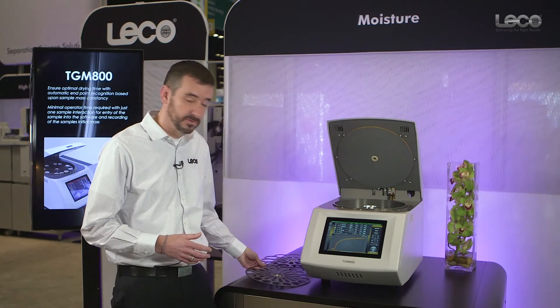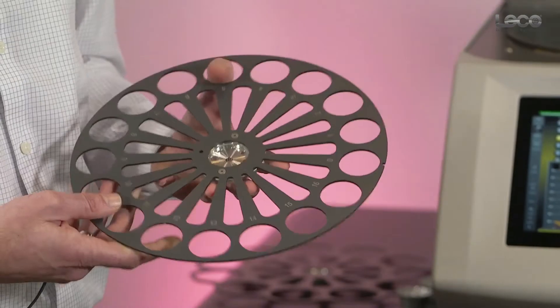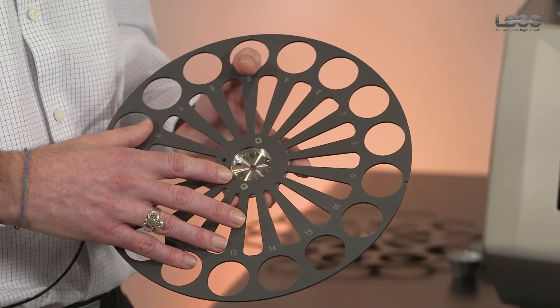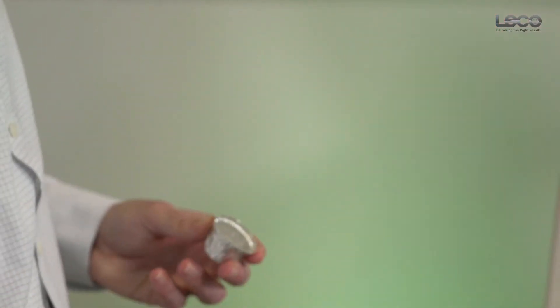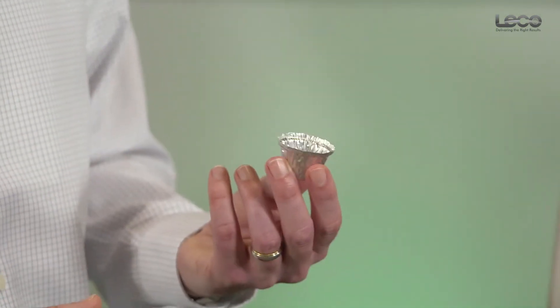We have two carousel options. One with a capacity of 16 samples — this carousel supports crucibles that are one and a half inches in diameter, composed of aluminum foil. This crucible will fit a sample that's approximately one to three grams in mass, depending on density.